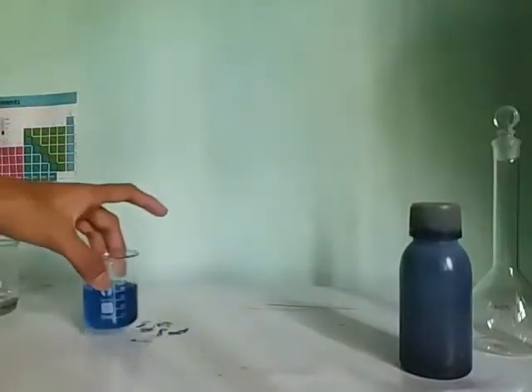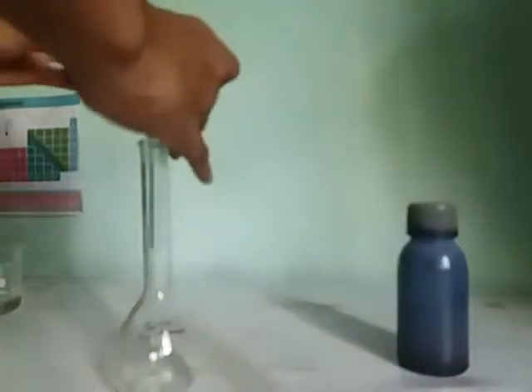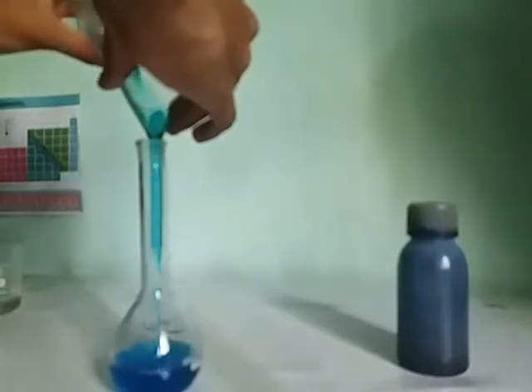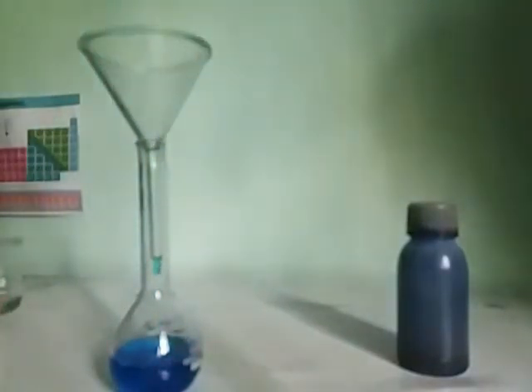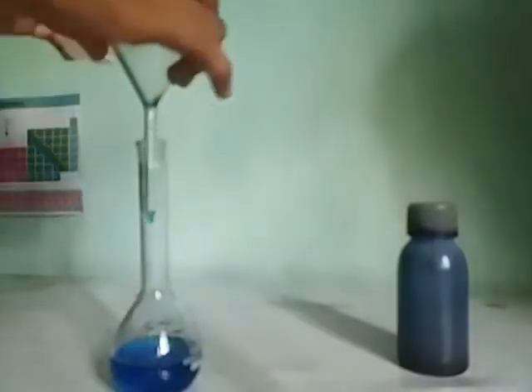Now get the flask and pour in this solution, then add the sodium hydroxide.